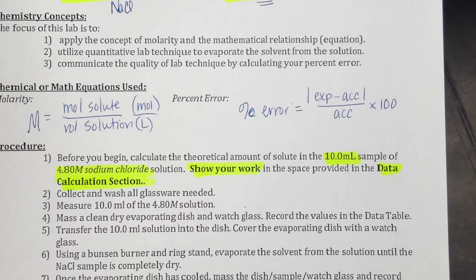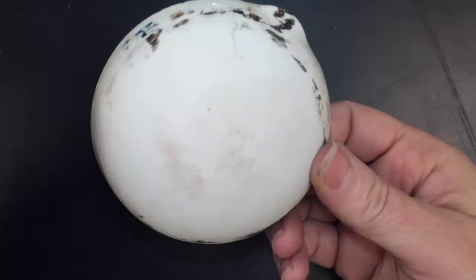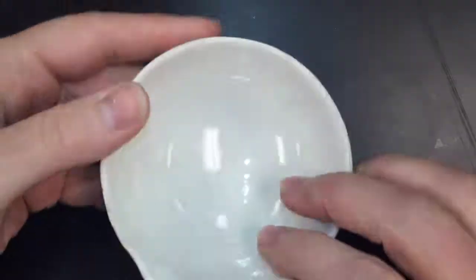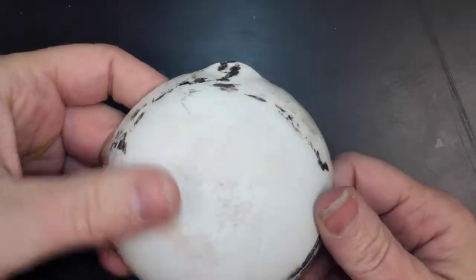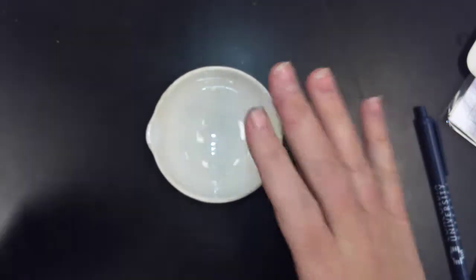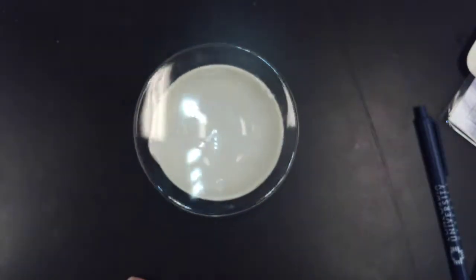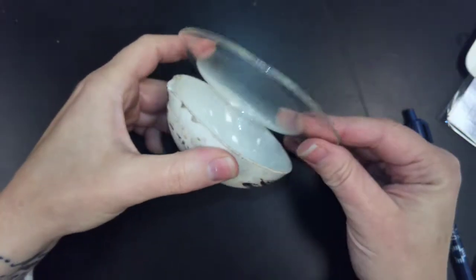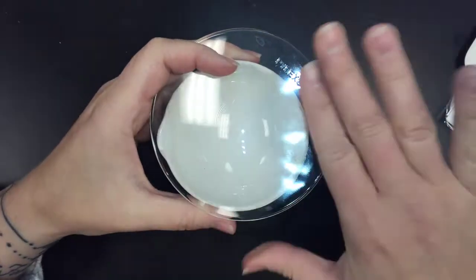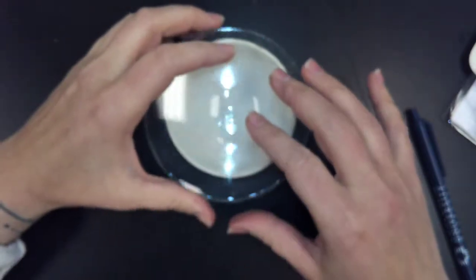So let's figure out what we're going to need in lab today. We're evaporating a solution, so in lab, we will need an evaporating dish. Always check your evaporating dish for any hairline fractures that could exist in the porcelain. I don't see any, so we're good to go. When I evaporate my sodium chloride solution, once it starts to get dry, that salt is going to want to pop. I want to prevent any loss, so I will want a watch glass. Note the watch glass goes on so that the concave part goes into the evaporating dish. So glassware: evaporating dish and watch glass.